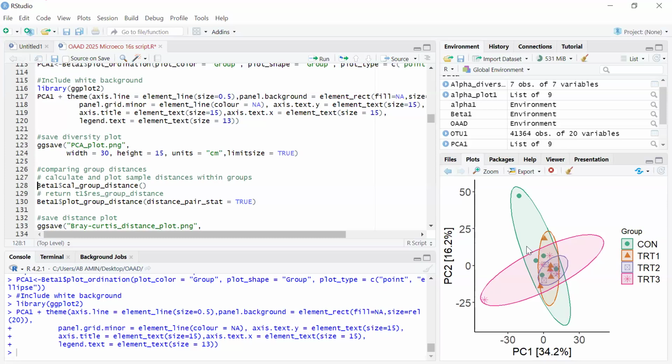I was also a bit confused with this PCA in the first instance. That's why I asked, because the PCA I'm used to as a trait person is like, we project the trait, it shows us the variables, so we know which ones on PC1 and PC2 have the strongest contribution. But this is a new field to me. So that's why I asked that underlying question. So that's the question he was trying to ask. Thank you, sir.